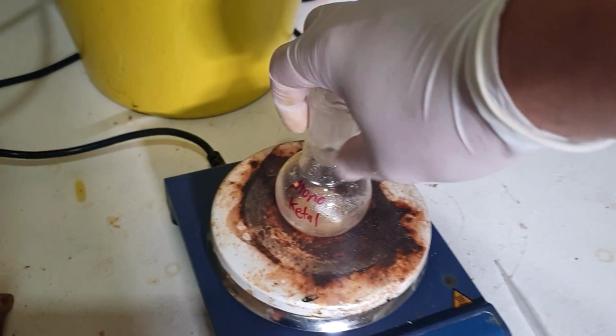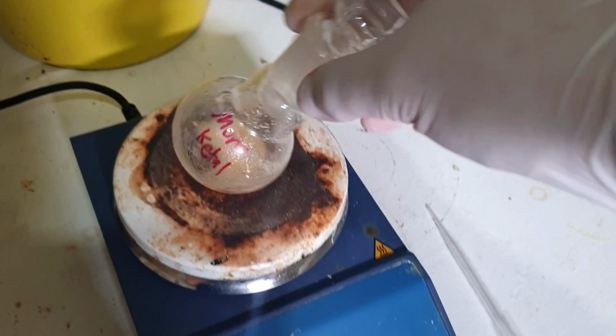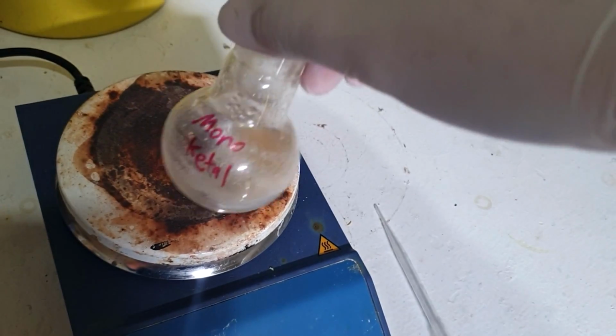Right, so it's had several more hours of reflux. It's since cooled down. A week or so has passed, maybe 2 weeks. I don't know, time eludes me. But we've got some stuff crystallizing out of the reaction mix. It's probably because I didn't use enough dichloromethane, but I believe that's our product. It looks excellent, so I'm not going to complain. I reckon I'm just going to collect that solid. We'll call that our final product.